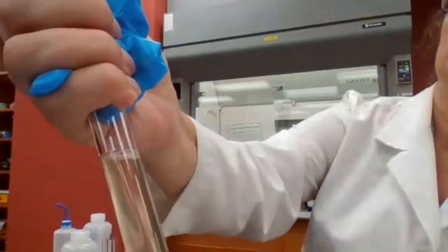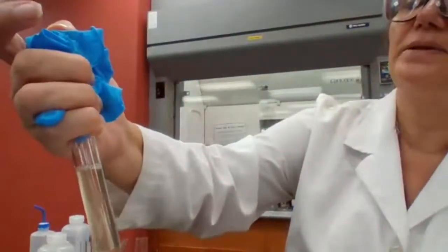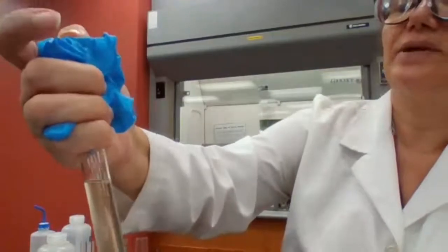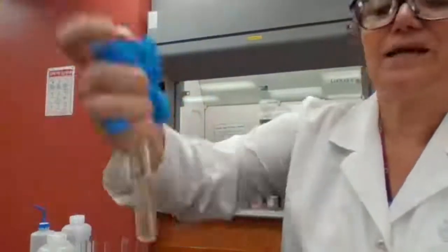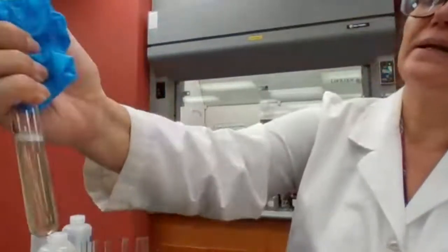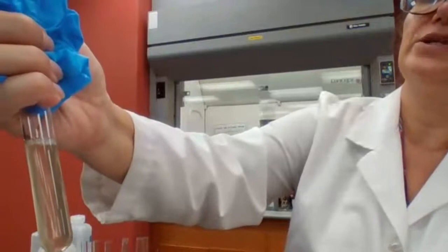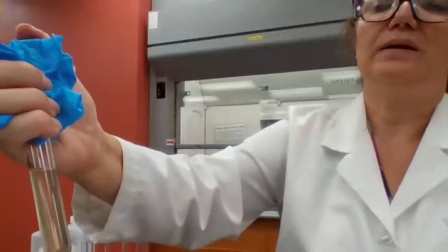But the precipitate dissolved here. I'm glad that before starting this experiment, I told you that silver nitrate is not a reliable test for most of the acids. I guess I picked benzoic acid, which was the wrong choice, and it is not following what it should be. What is written in the manual is correct though, okay?